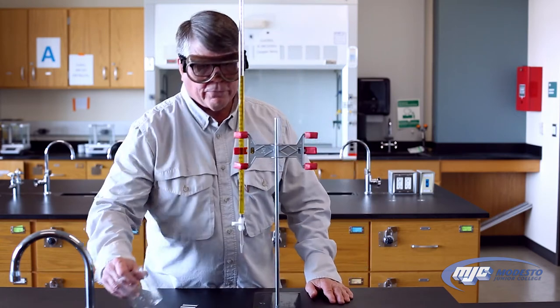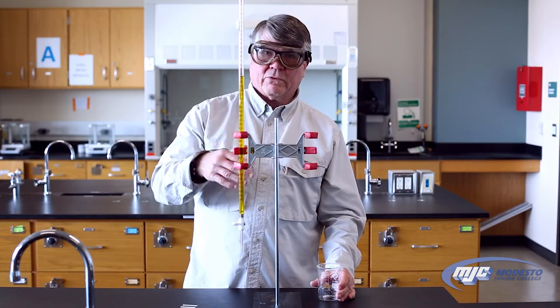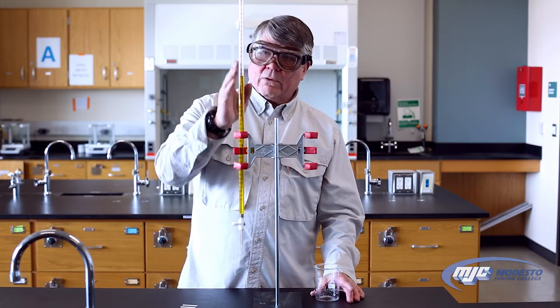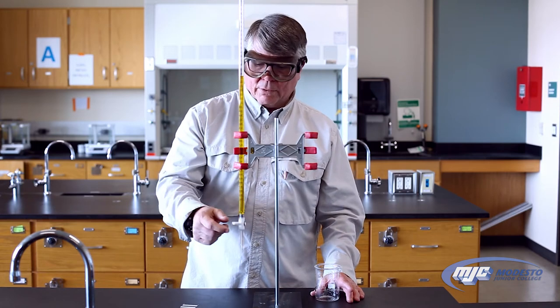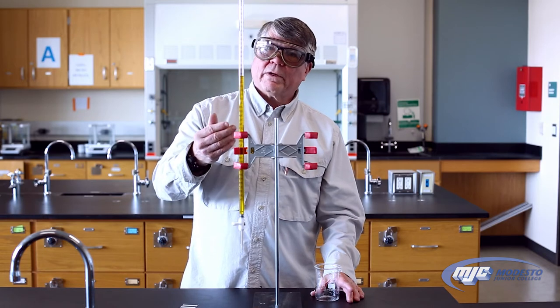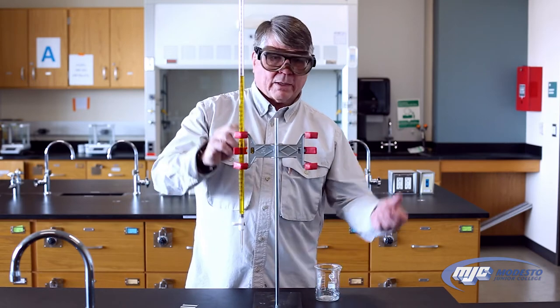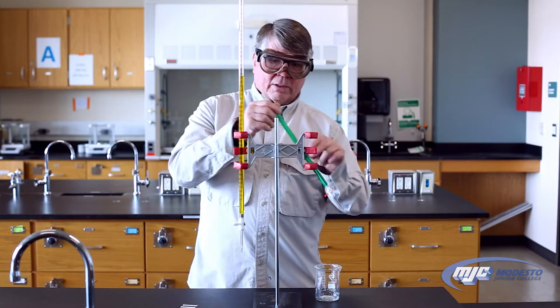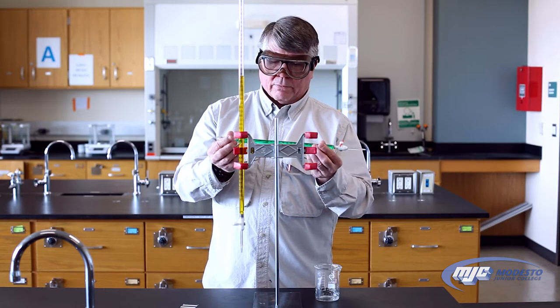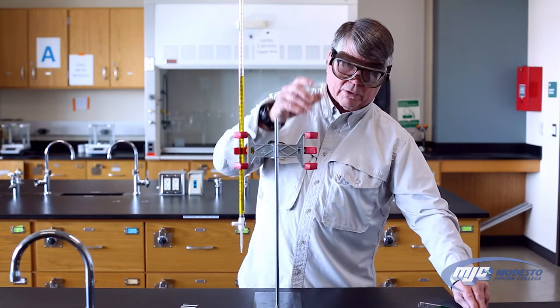When you first fill the burette with your solution, make sure it's clean and there's nothing in there but the solution you're going to put in. Rinse it with DI water three times, making sure it goes through the tip. After that, take a little bit of the solution you're going to put into the burette — just a few milliliters — put it in, turn it sideways so that you coat the entire inside of the burette, and then dump that out. It's always useful to have a waste beaker handy.